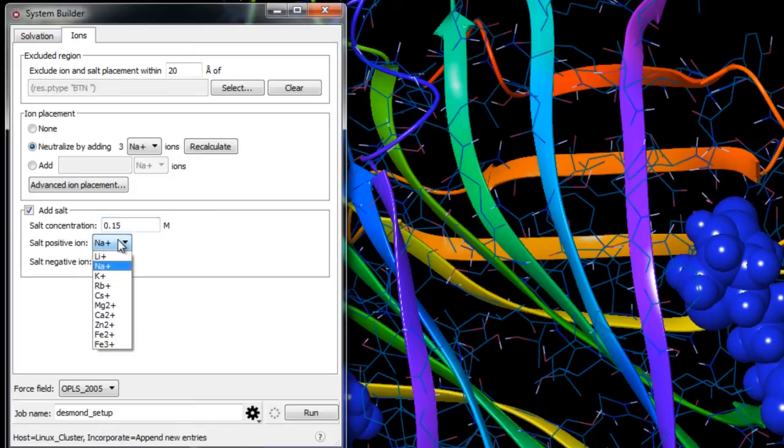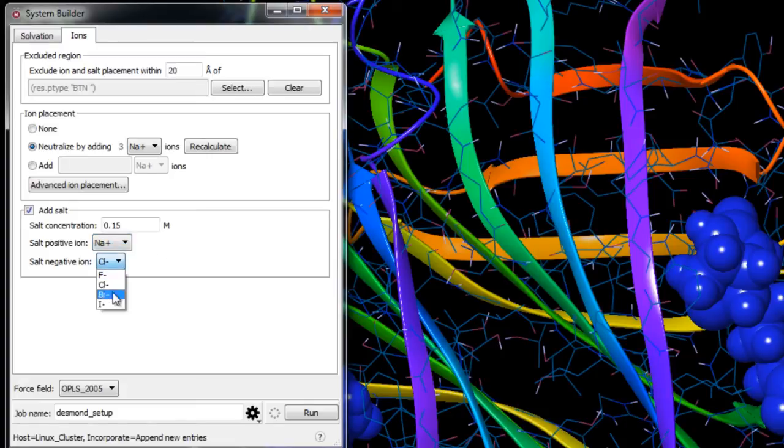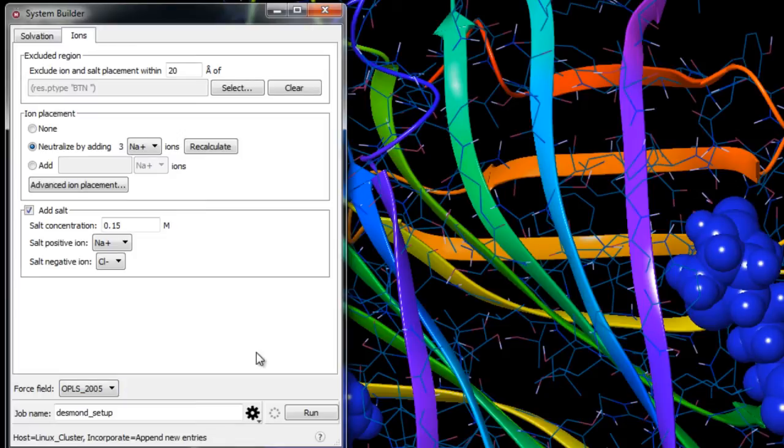We'll use the default force field as OPLS 2005 and then get ready to submit the job. Now before we click Run we'll open the job settings, give the job a name, and then choose a non-Windows host.